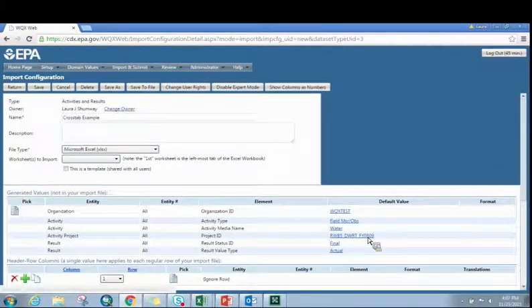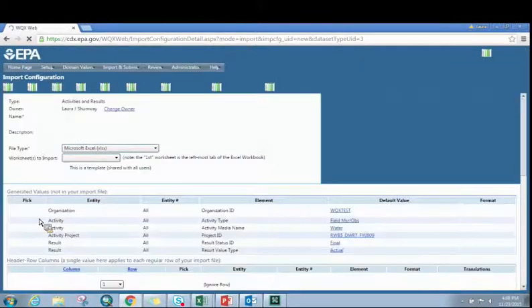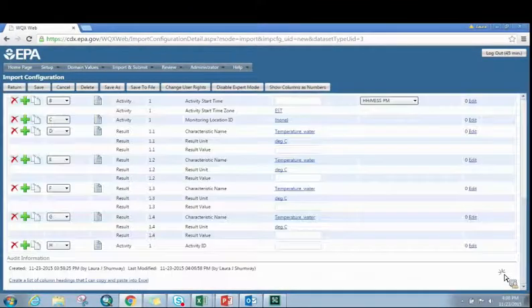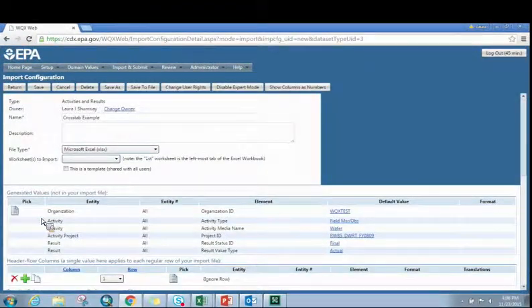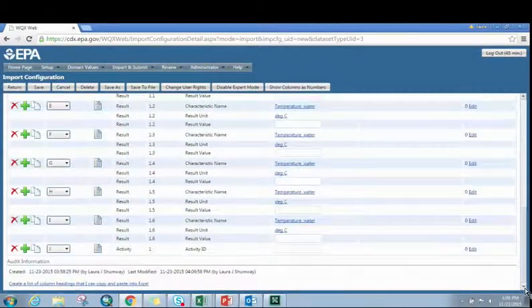Let's copy it. So we've copied it once. Copy it twice. You can see that now we have 3. We need a total of 7. So we have 1, 2, 3. Copy it. 4. 5. This is a new feature. This is a great tool to have. And 6. Double count. So 1, 2, 3, 4, 5, 6. We need one more. 7.